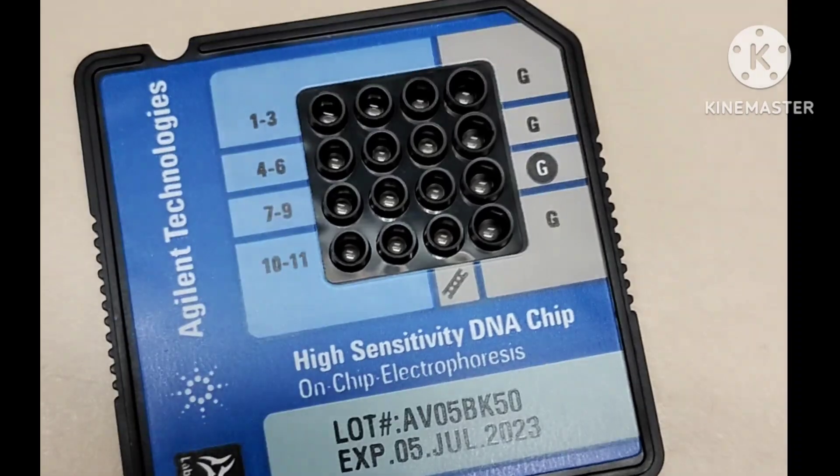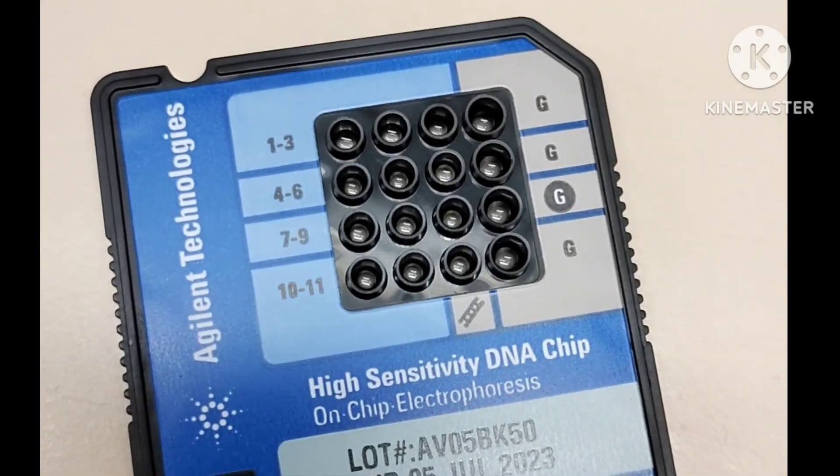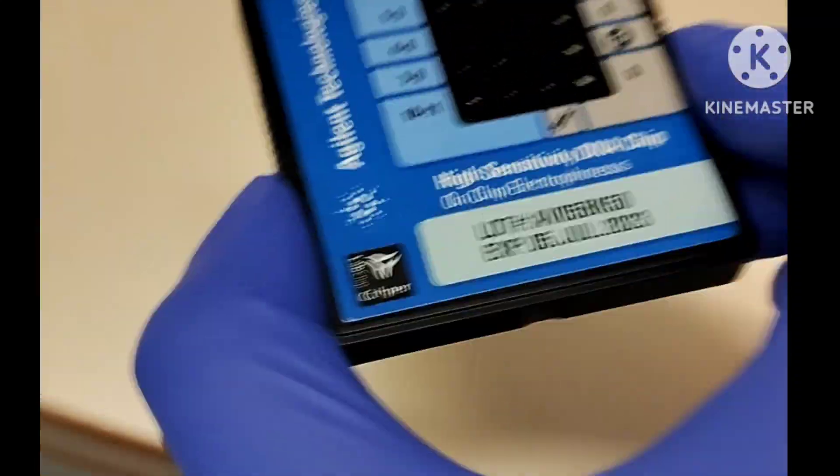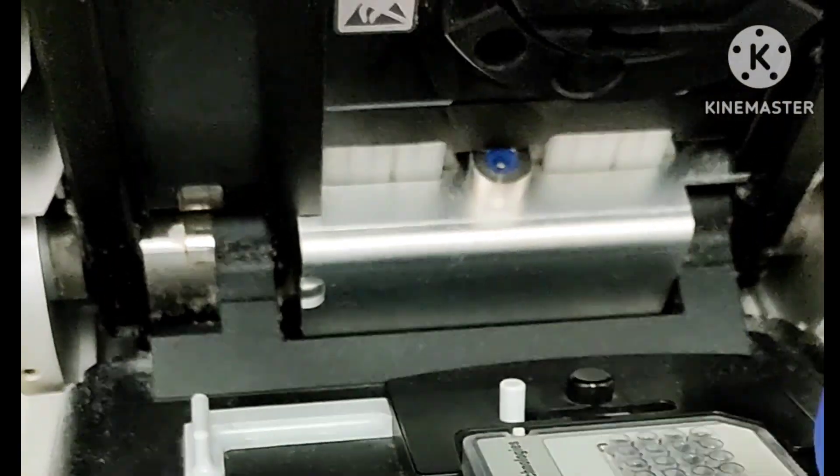After one minute, turn off the vortex and take out the chip. Make sure there are no bubbles—just check once. No bubbles. Take out the chip with nuclease-free water and add your new chip with sample.